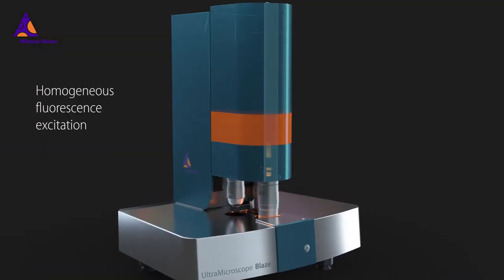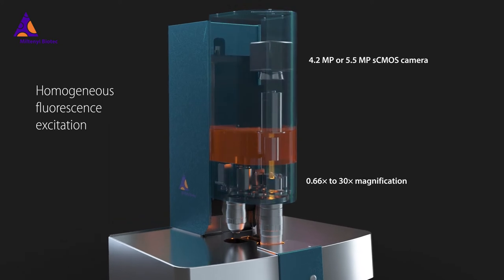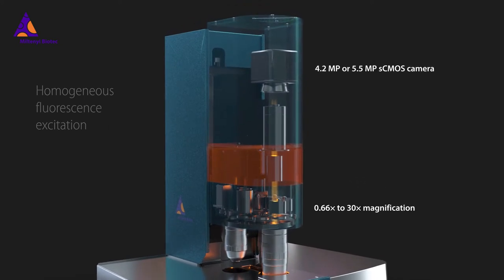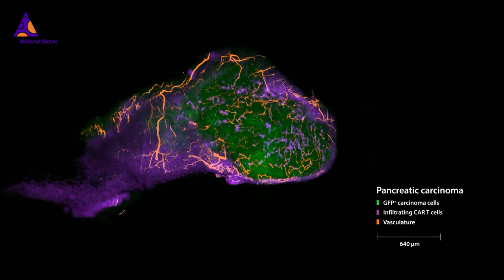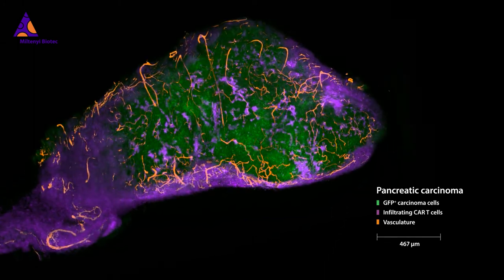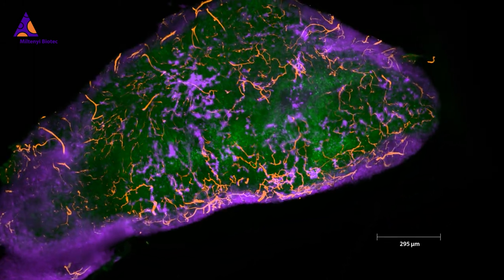Optimized illumination guarantees homogeneous fluorescence excitation. New insights allow us to answer questions we didn't even know existed.